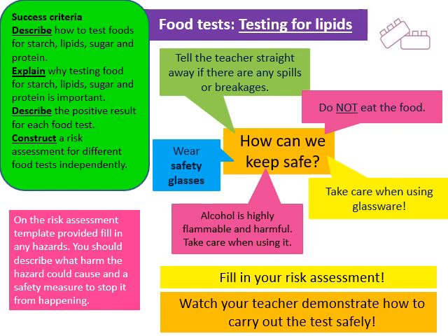I'd like you to use this information, plus any thoughts you've had about the method as you've read through it, to again fill out that risk assessment template. Make sure you've described what the hazards are, the harm they could cause, and your safety measures to prevent that harm from happening.